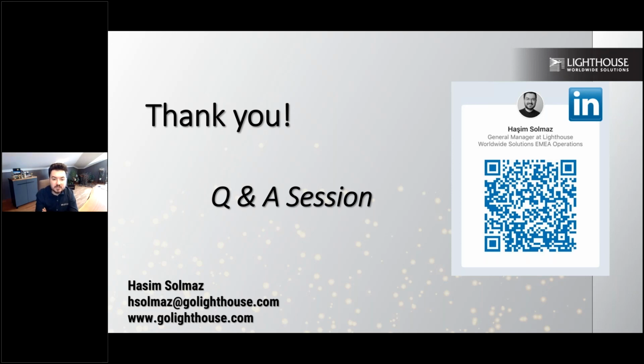For a handheld particle counter with 2.8 liters per minute, can I use it for classification? That's a good question. If you are trying to classify an ISO class 7 and 8 clean room, I'm completely fine with it because your expectation is a minimum of 2 liters. For ISO, that's okay. But for GMP, forget about it. For GMP, you should use a high flow rate instrument, at least 28.3 liters per minute, for classification. The handhelds, these 2.8 liter per minute instruments, are quite inefficient for this kind of application.